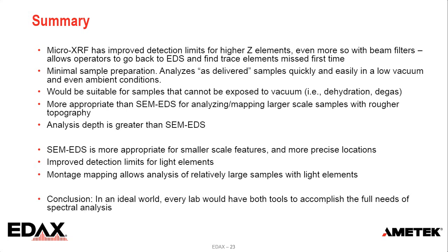Like I used a longer dwell time. And for the second montage example, which is the sand grains, I used just 20 minutes to collect that map.